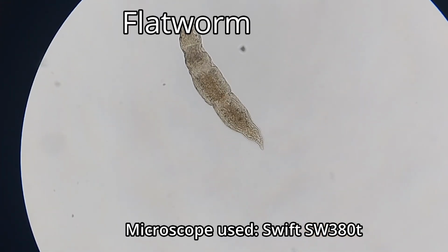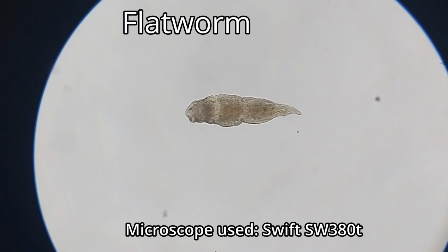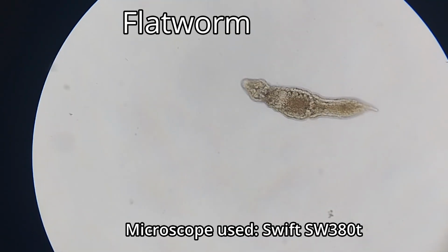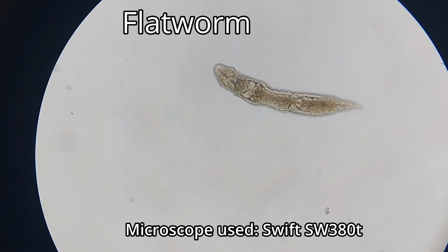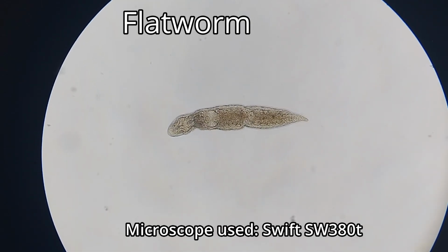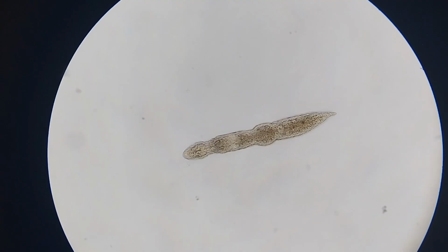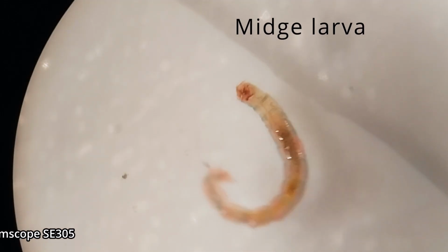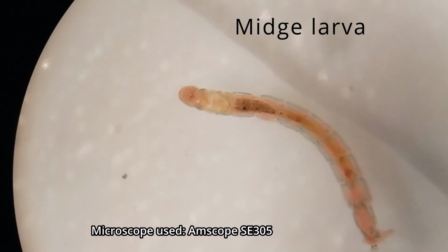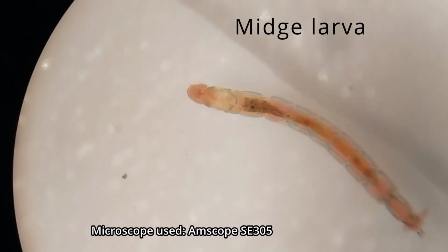Another organism found in the macroalgae is a flatworm. Flatworms have a flattened shape in order to allow oxygen to flow into their bodies. They take in oxygen through diffusion, because they don't have a respiratory or a circulatory system. I also found quite a lot of these, which are the larvae of some kind of flying insect, most likely a midgefly.